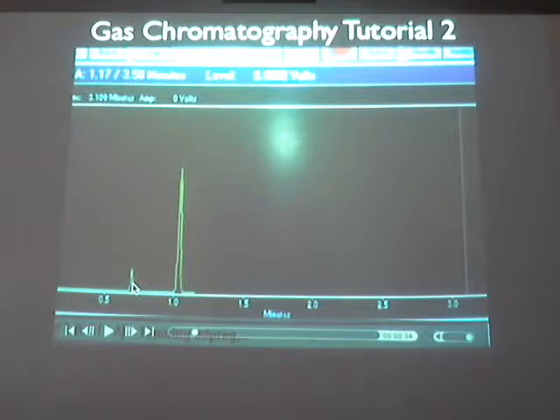Okay, the other part must have been a little heavier. Also, notice the size of the peaks. Very large. What does it mean? The size of the peak, if you get the area under the curve, which you probably could do from calculus, right? You can tell the percentage of each of those guys in that mixture. So obviously, which of these has, which is there more of? It's the bigger peak, right?